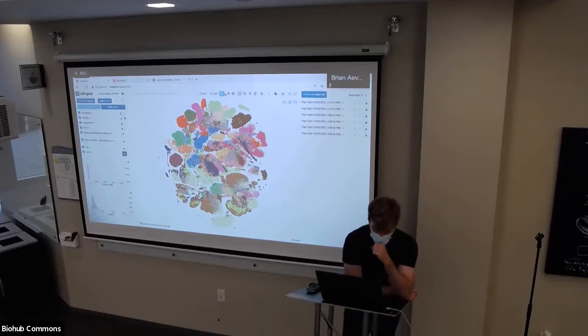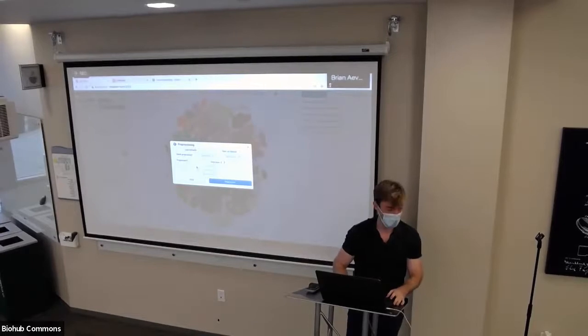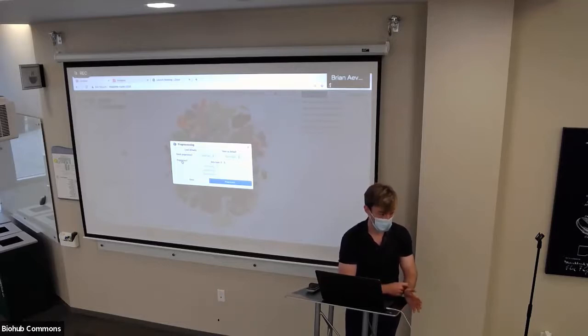Most users would not need to modify these whatsoever. That's why I adopted this collapsible thing. I don't want to show all these scary looking knobs if they're not interested in tuning them. And these are defaults that are chosen by ScanPy. So whatever wrapper the Scanorama people have developed through ScanPy's external tools package, I'm just using the same default parameters for those. Oh, I see.